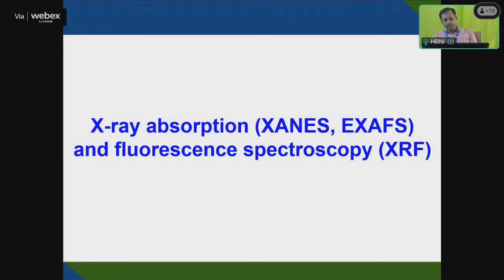No. See, in the case of synchrotron, the energy beam is widespread, so you can get from visible to X-ray, up to that generally. You have a wide spectrum. Depending upon your technique, if you want to take UV, UV you can also do with synchrotron. You take out that particular wavelength from the beam line and you do UV.